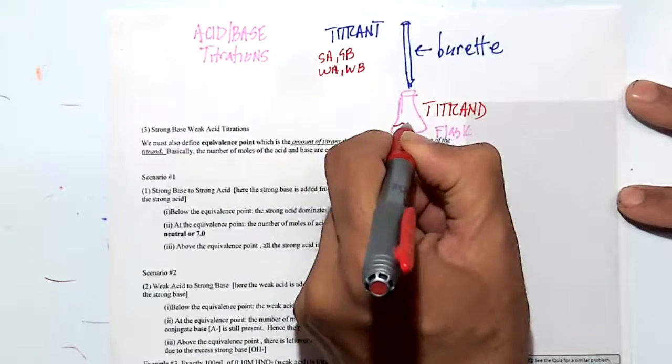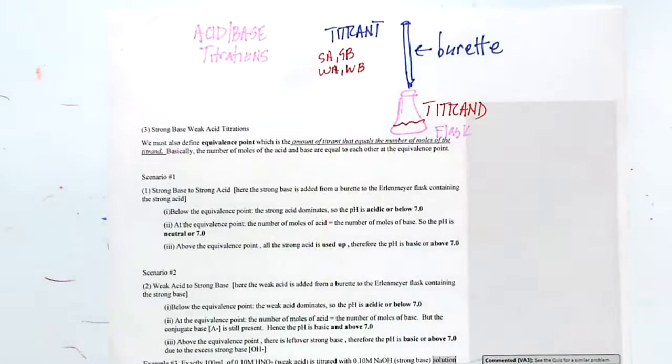Okay, that's the liquid in the flask. So we have titrant goes to titrand. That's what this thing is called, the titrand.